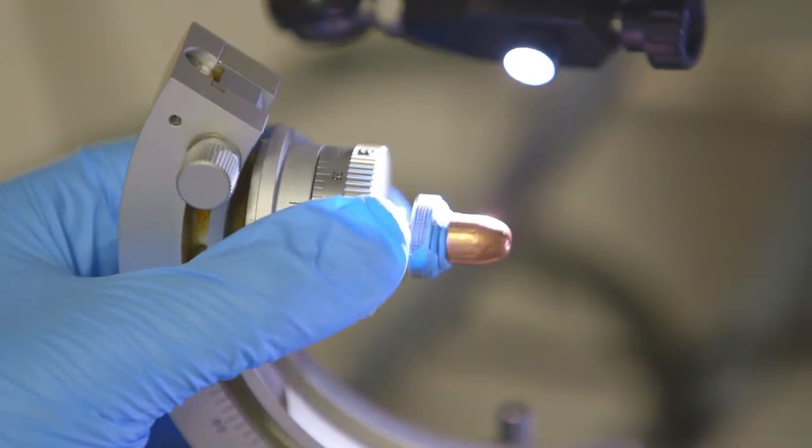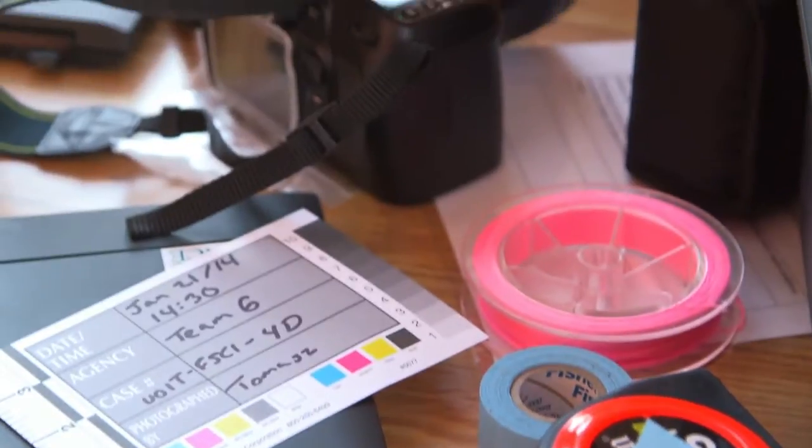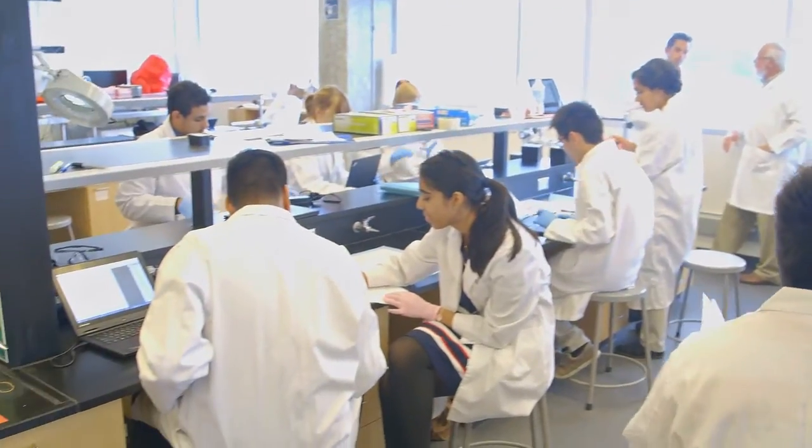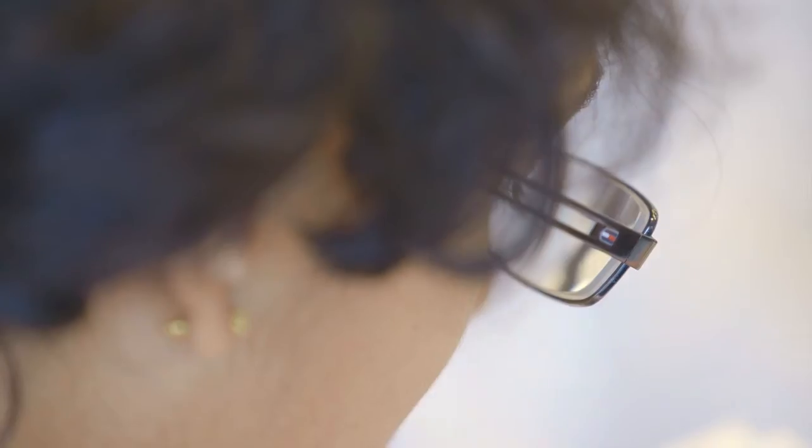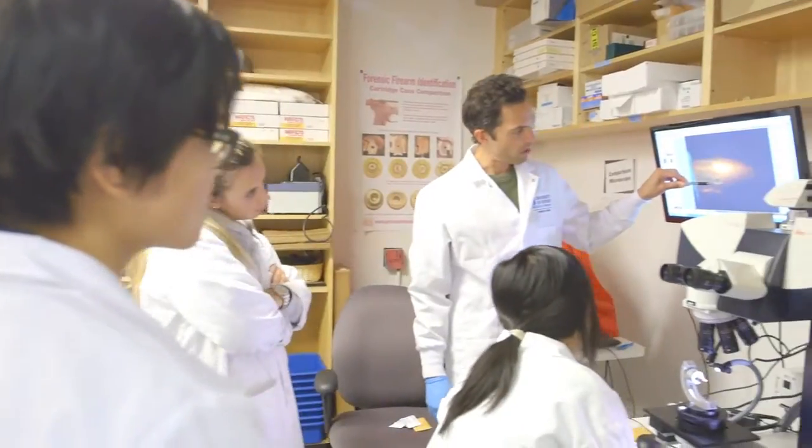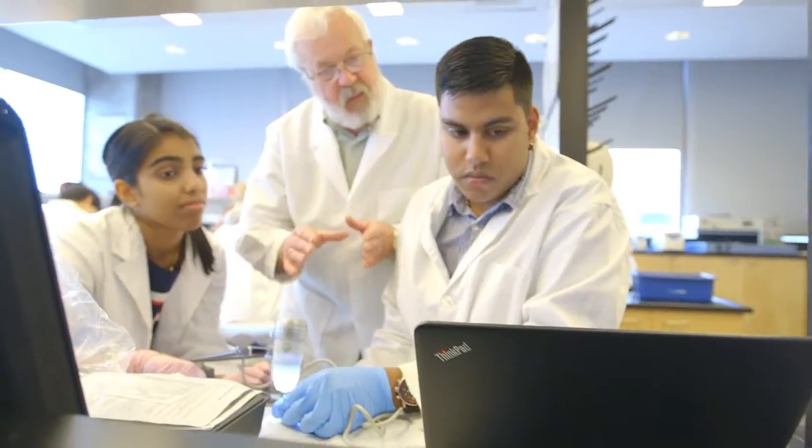The practical components of the program are taught in both our laboratory and field facilities. The Forensic Science Laboratory is equipped with state-of-the-art instrumentation and here students develop strong skills and experience centered on microscopy, forensic biology and forensic chemistry.